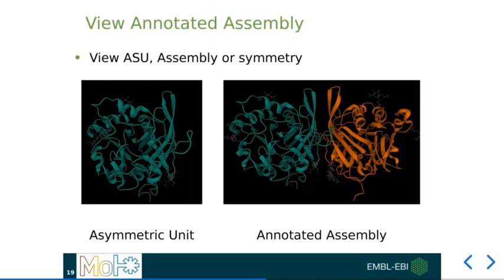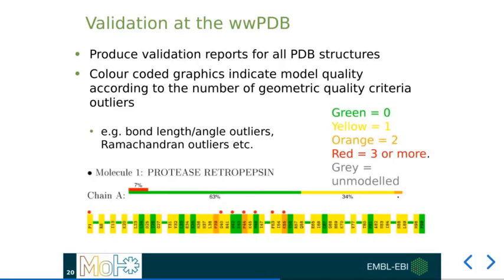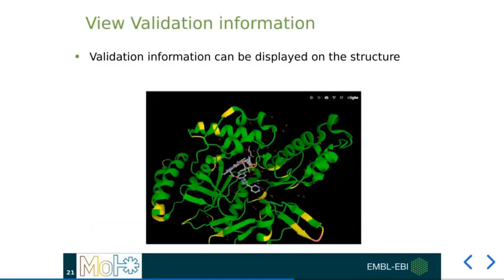I'd like to think that perhaps most of you are familiar with the PDBe's validation reports that we produce both during deposition and alongside our entries online. Now, these have a simple color code from green to red that describes the accumulation of geometric issues at the residue-specific level. And using this information, we can combine it with a coloring scheme across our protein, so that we can start to visually interrogate our validation metrics from any entry from the PDBe archive.